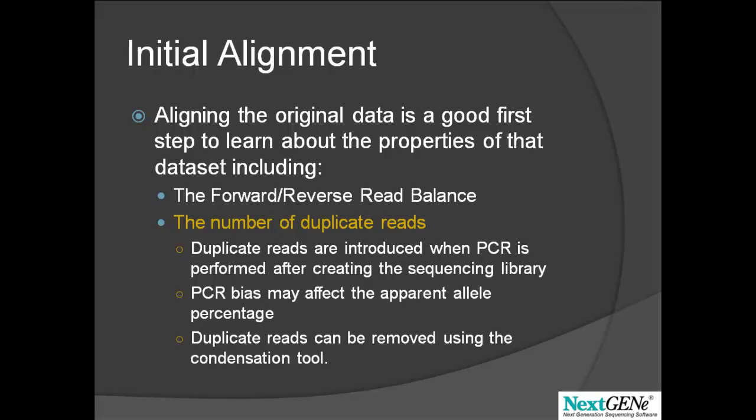The advanced settings can be adjusted to keep single copies of duplicate reads and copies of non-duplicate reads, or to only keep the single copies of duplicate reads. If the coverage is high and most reads are duplicates, it may be useful to only retain a single copy of duplicate reads because the remaining reads are unique only because of sequencing errors. If a smaller fraction of reads are duplicates, or if removing duplicates reduces the coverage too much, it makes more sense to retain all non-duplicate reads in addition to keeping a single copy of duplicate reads.